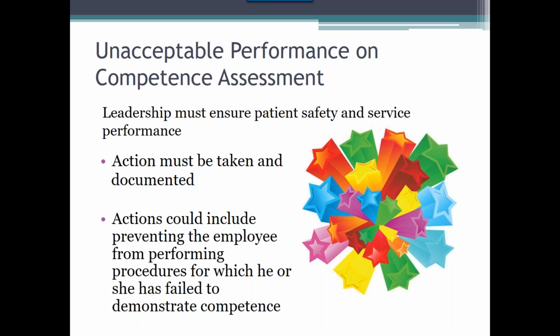Although it doesn't happen often, there are times when employees must be removed from performing a particular test system because they have not demonstrated their competence in doing so. And it is more significant than just missing a step. In these situations, the employee must really start the process over as if they were a new employee. They must complete a training cycle and then a competency cycle again.